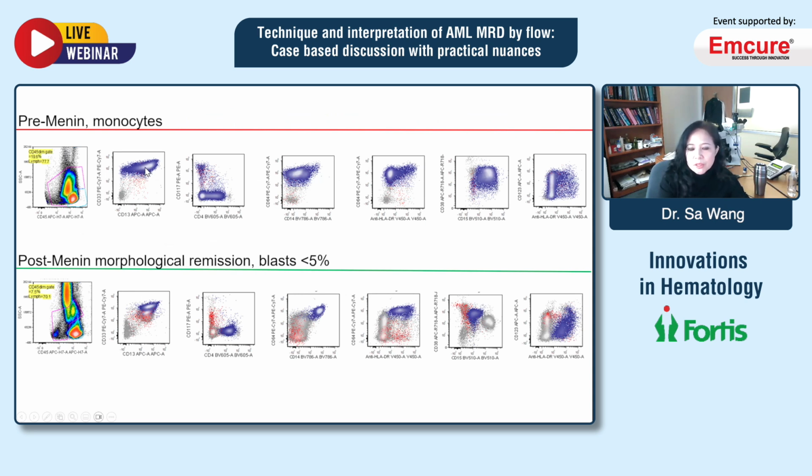So you see these blue cells. They have CD4, very few CD117, a small subset. And then they have significant loss of CD14 and also almost no HLA-DR expression. Very high CD15, remember, corresponding to immaturity, and also increased CD123, right? The monocytes are very abnormal.